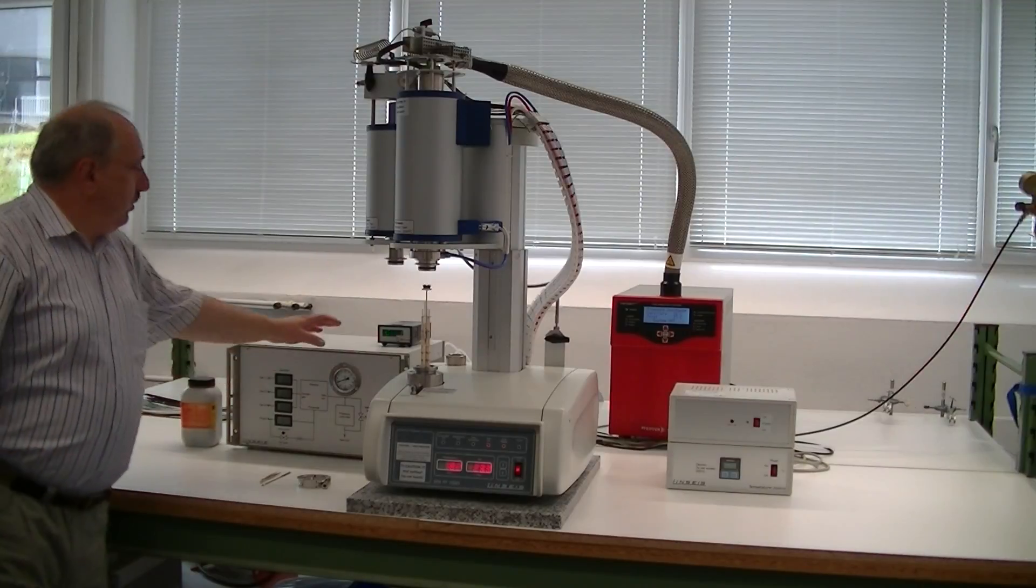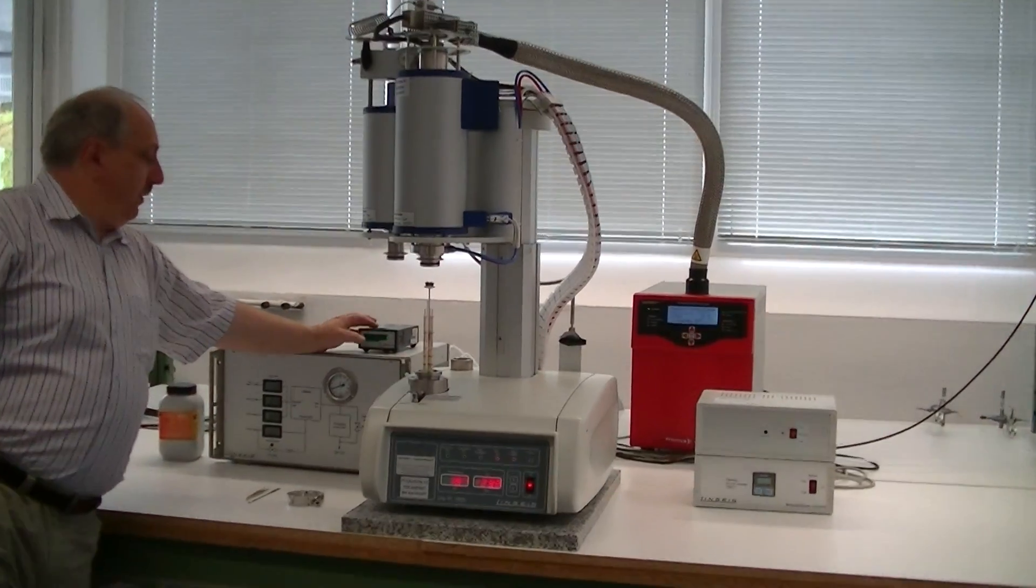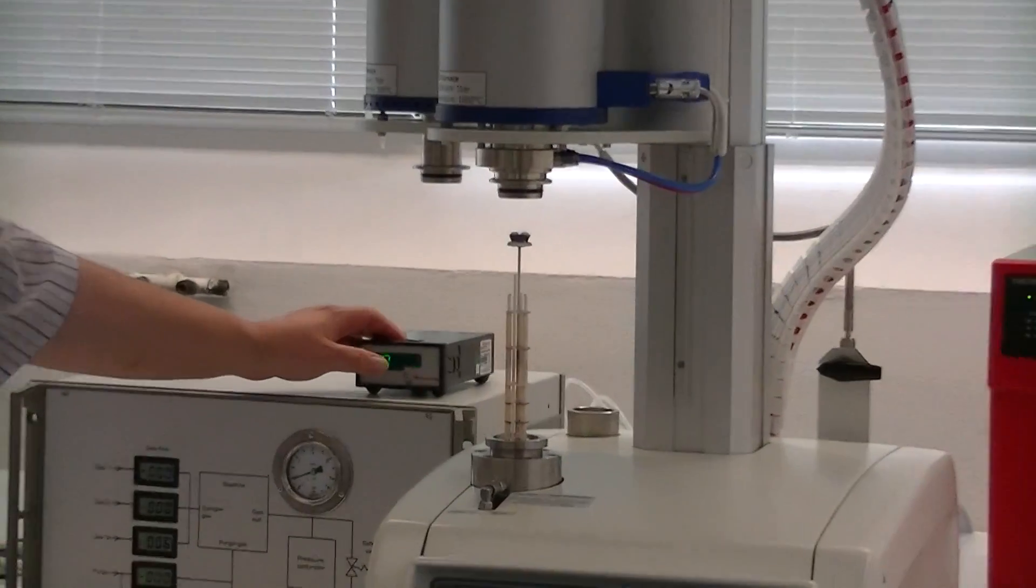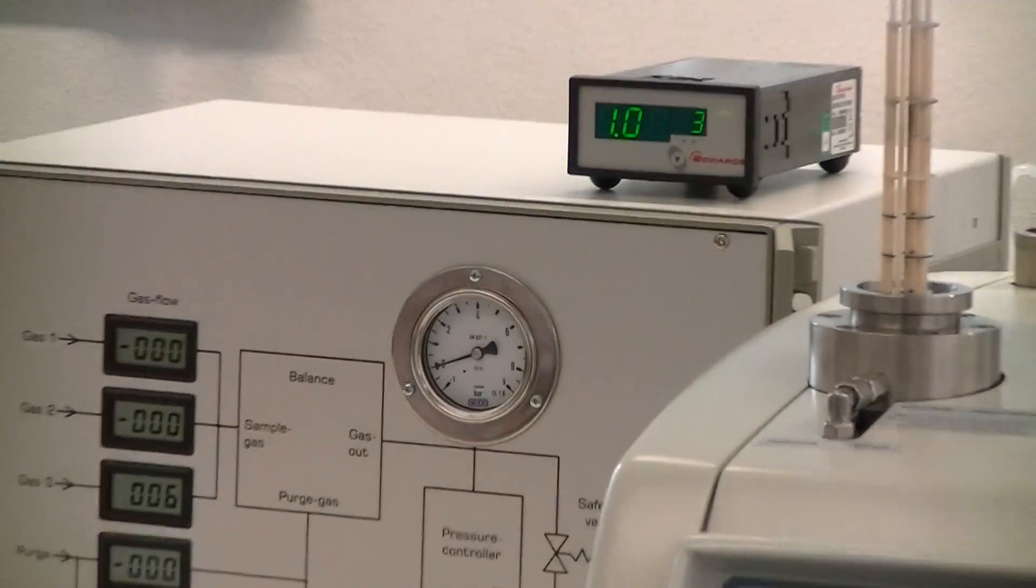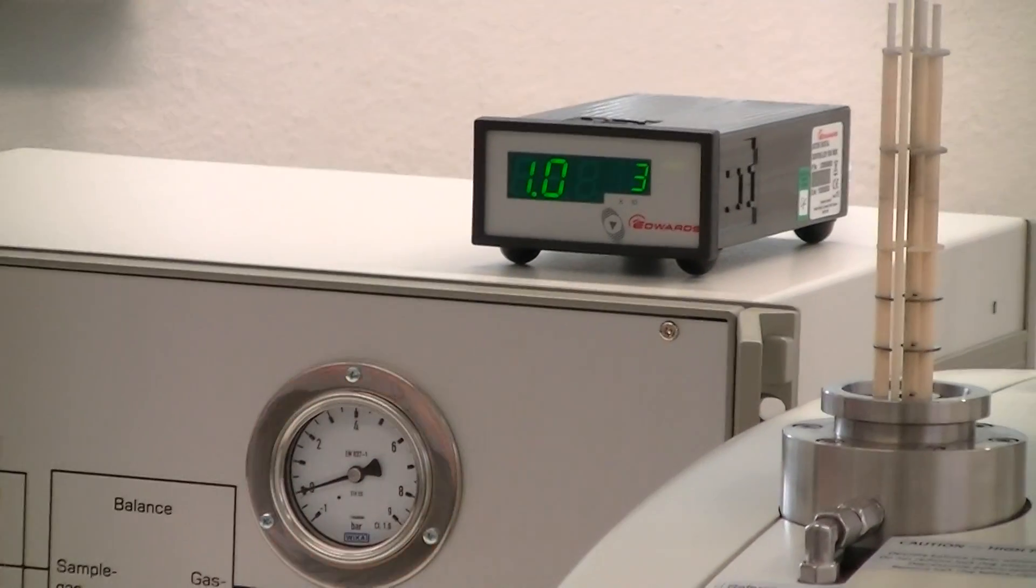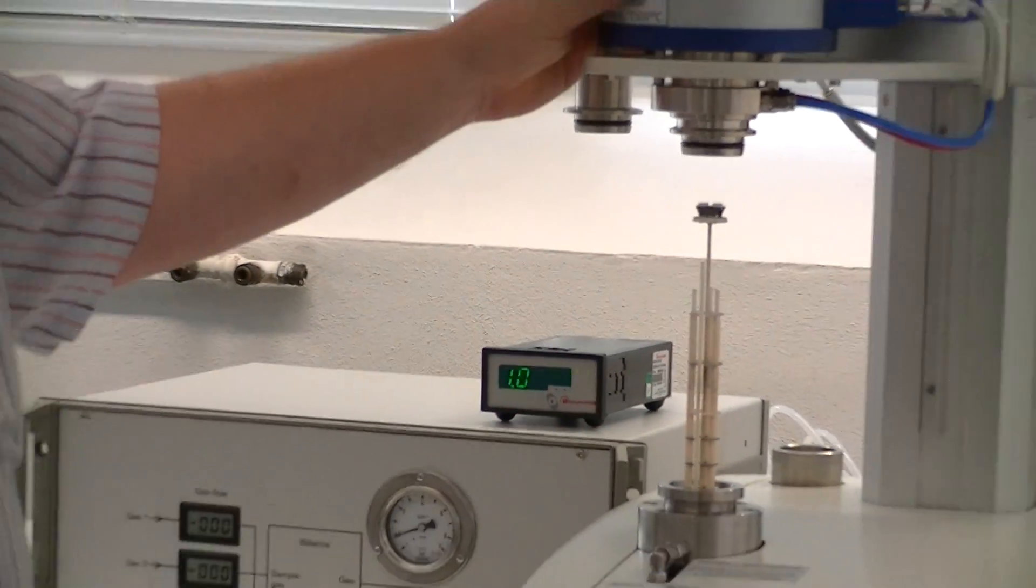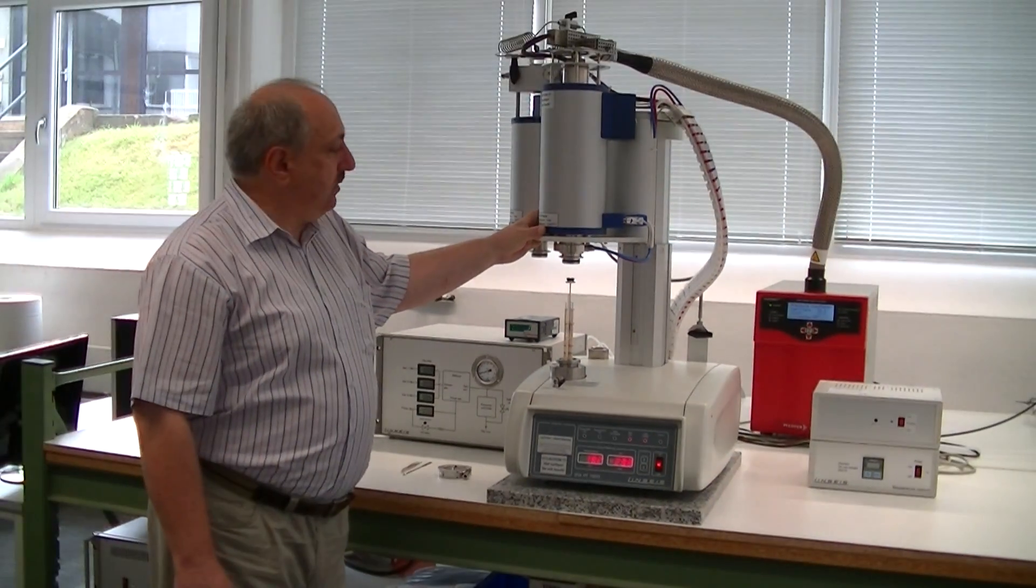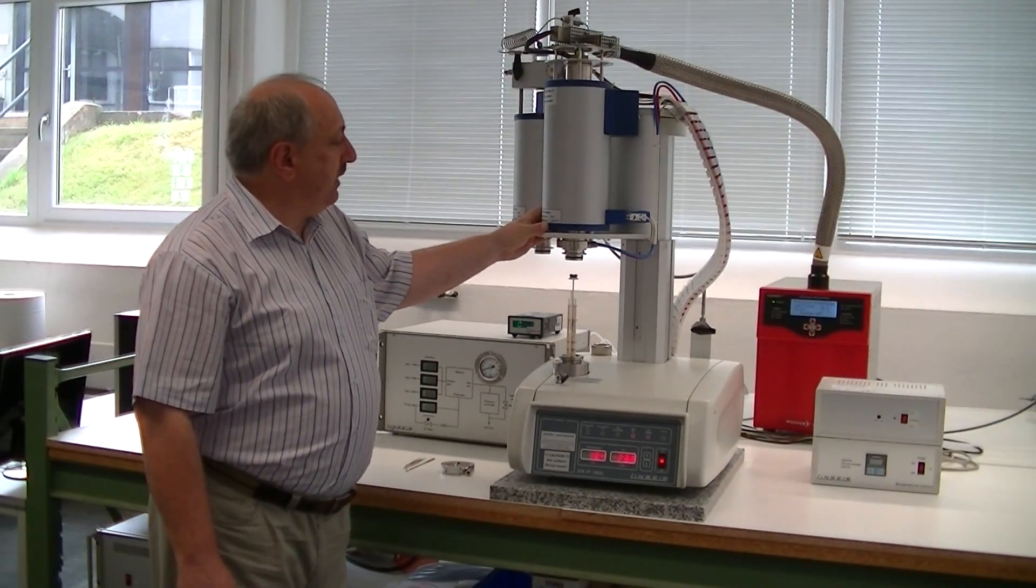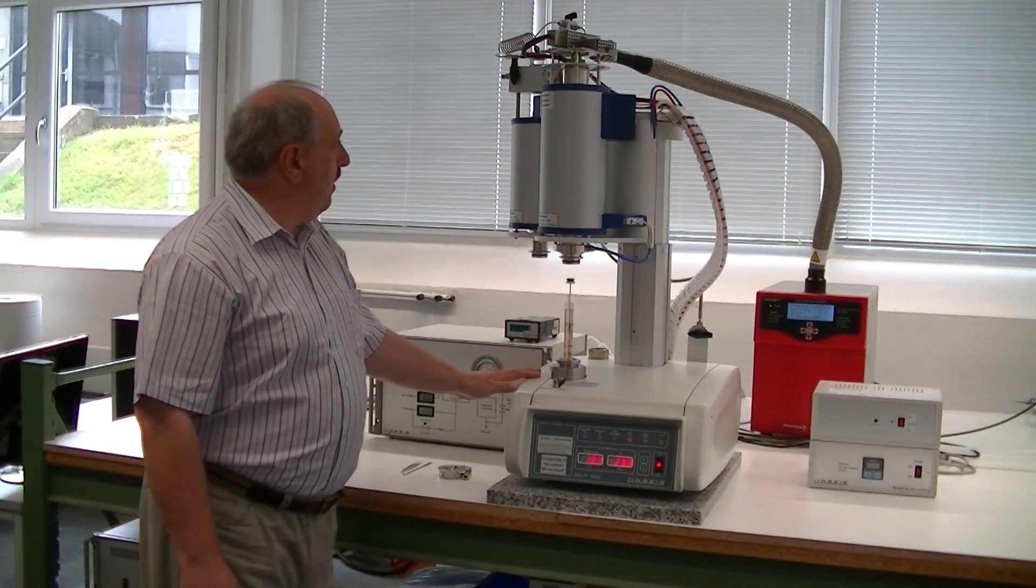You see here, it is a vacuum heater, you see the vacuum, the gauge from the vacuum pump. In the moment, the normal pressure furnace up to 1000 degrees Celsius is on the measuring system.